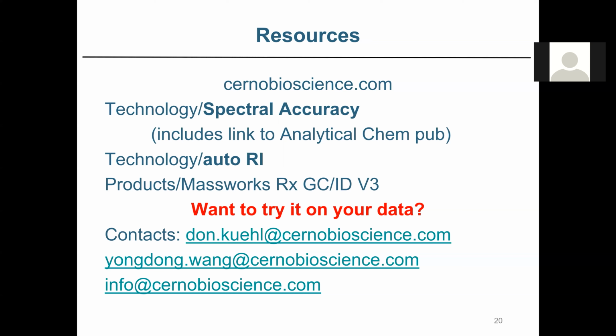And then last but not least, is there a software IQ/OQ protocol for the software? I guess it's compliance testing for publishing. We have our internal processes, so we don't have a formal external document for that.